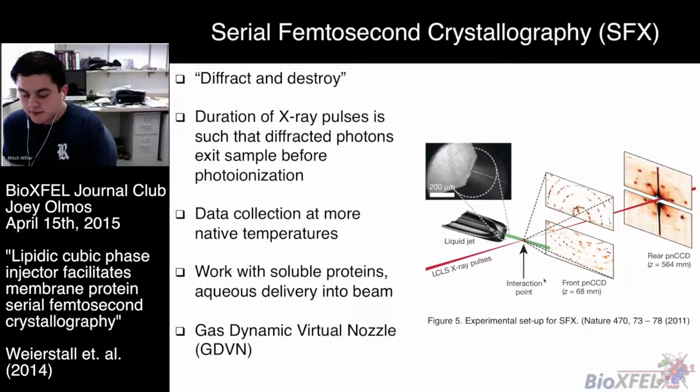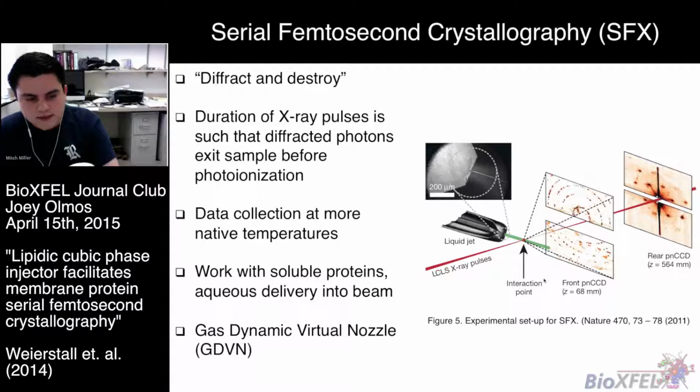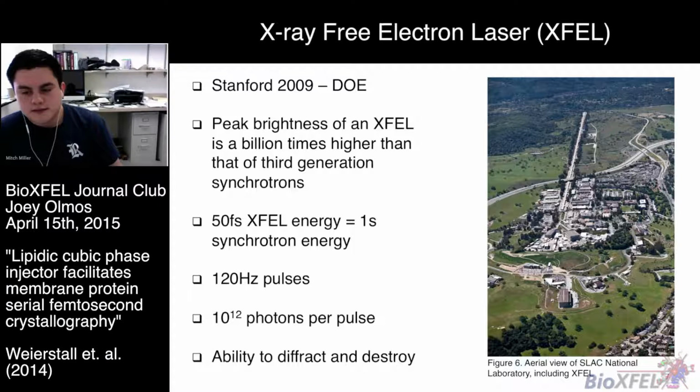So before this paper, SFX involved soluble proteins in aqueous delivery into the beam, and that was mediated through the gas dynamic virtual nozzle. I'll talk about that in 2 more slides, but here's just an aerial shot of the XFEL. It was established by the Department of Energy at the SLAC National Laboratory in 2009.